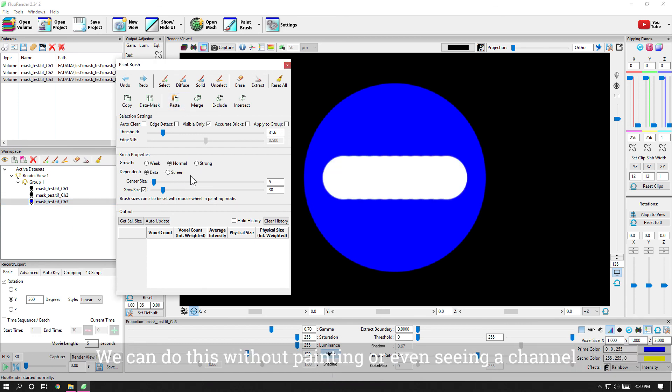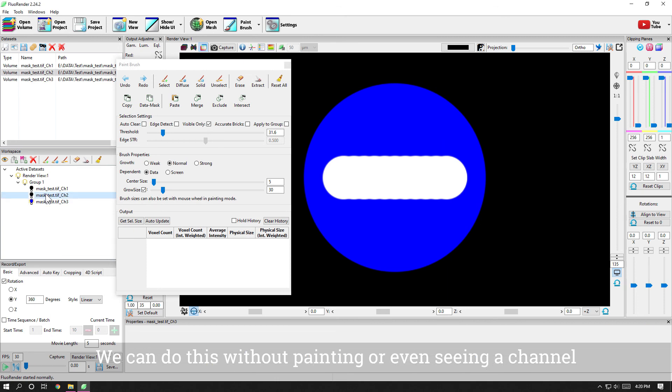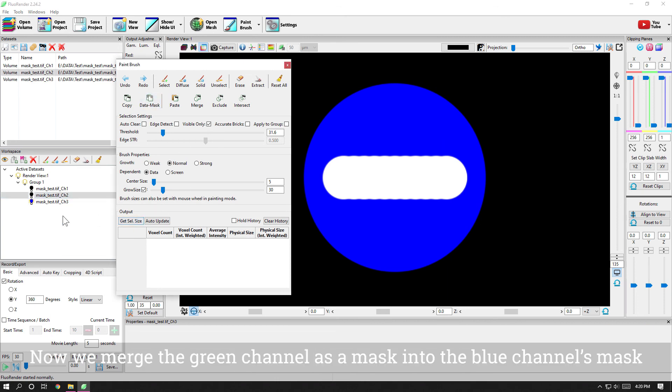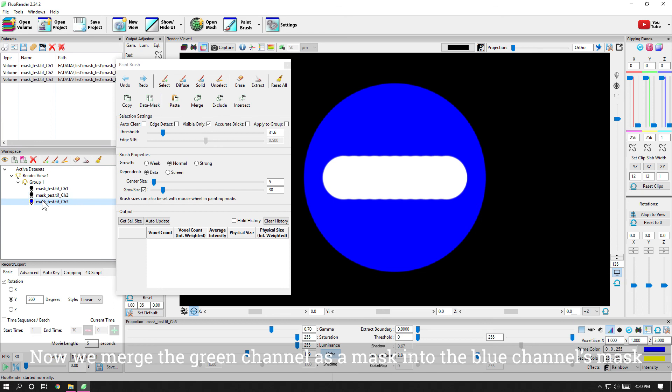We can do this without painting, or even seeing a channel. Now we merge the green channel as a mask into the blue channel's mask.